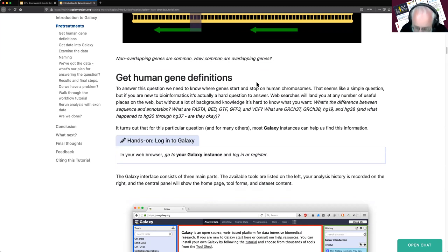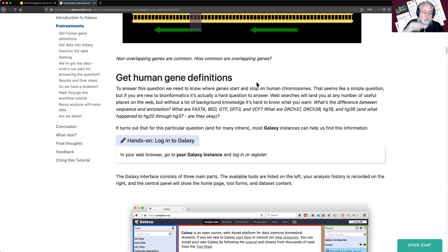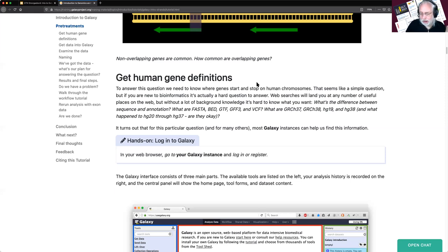How are we going to ask this question? We need information about where genes are, and today we're going to get that information from something called UCSC. That information should have what strand it's on and where it starts and stops on each strand. Then we figure out how to calculate where they overlap. But first, let's get our data.